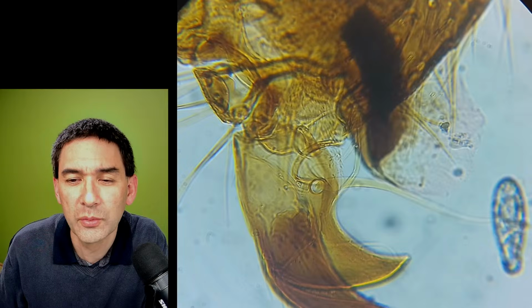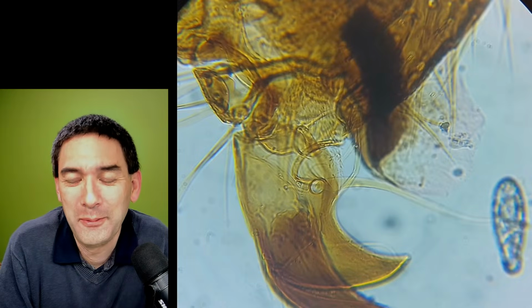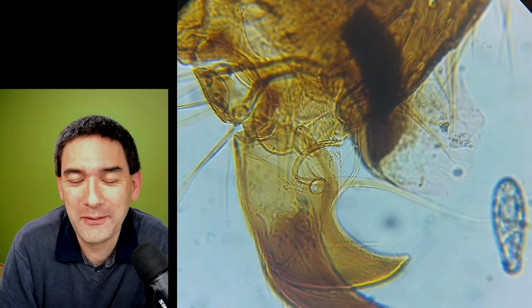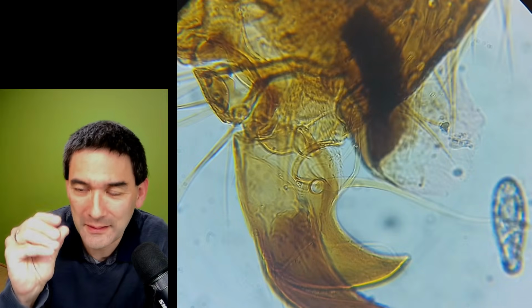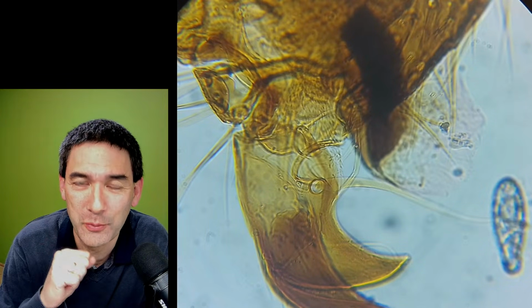I want to microphotograph text and put an entire human genome on a single slide. Also a full movie script, maybe the B movie. I will tell you what's possible. Indeed, somebody a few years ago sent me a silicone chip with a whole book on it to put under the microscope.